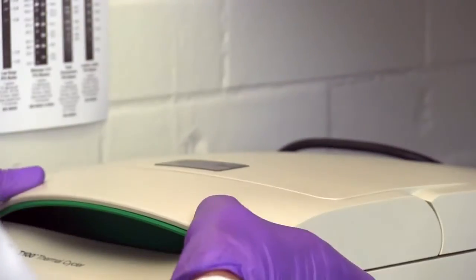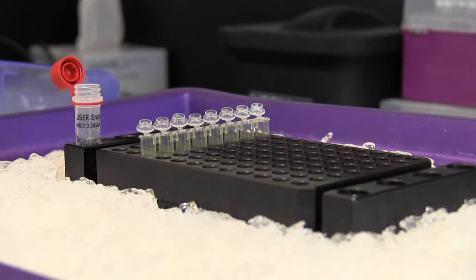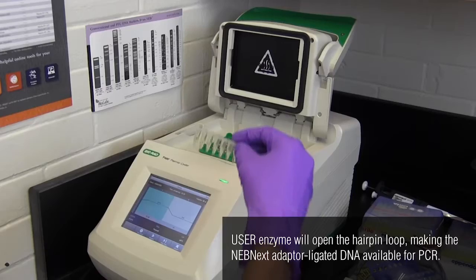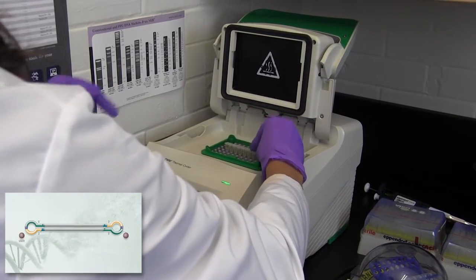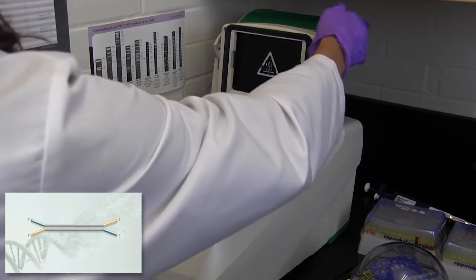Incubate at 20 degrees Celsius for 15 minutes in a thermocycler with the heated lid turned off. If you are using the NEBNext adapter, add 3 microliters of USER enzyme and mix. Incubate at 37 degrees Celsius for 15 minutes with the heated lid set to at least 47 degrees Celsius.